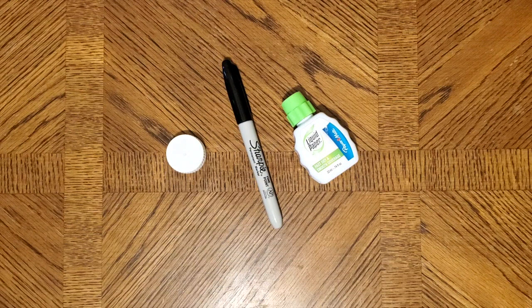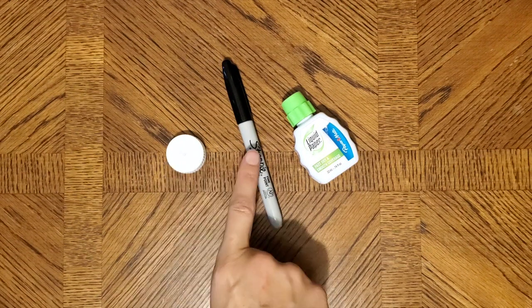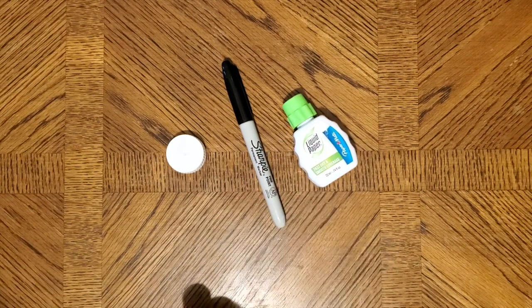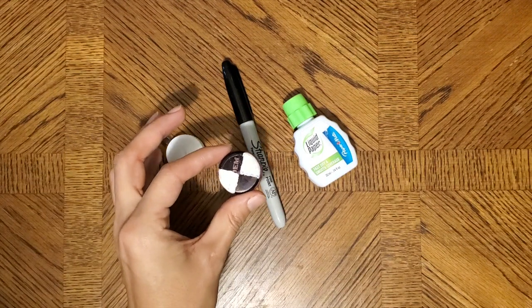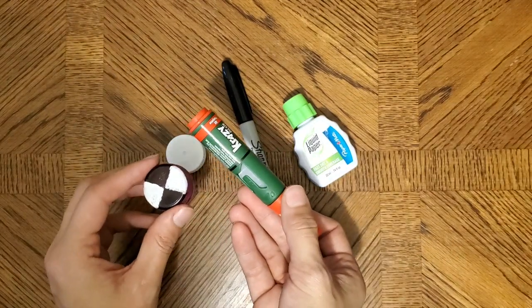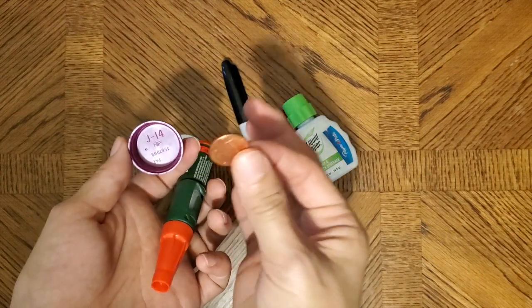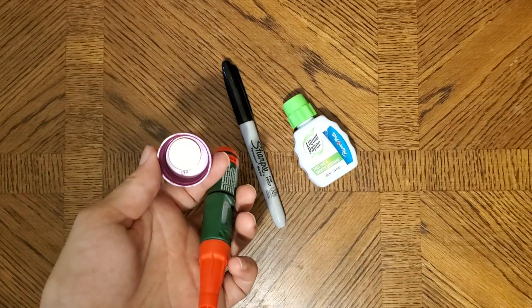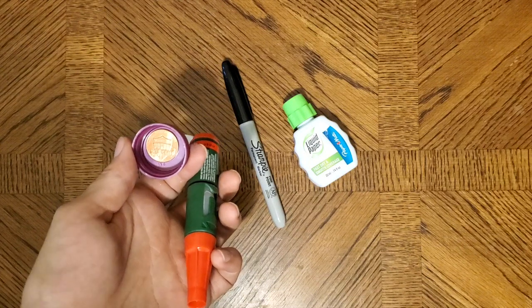To make your Secchi disc, divide your bottle cap into four sections and then use the Sharpie and, if needed, the white-out or paint to fill them in. The sections should alternate in color. Once everything has dried, use your hot glue or super glue to attach the penny to the inside of the cap. This will help your Secchi disc sink.